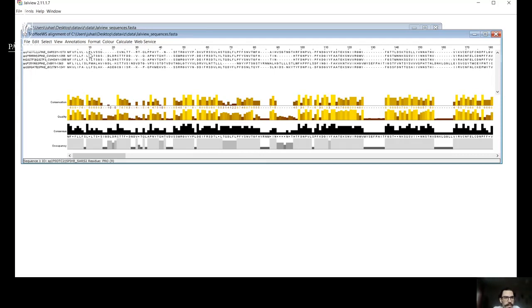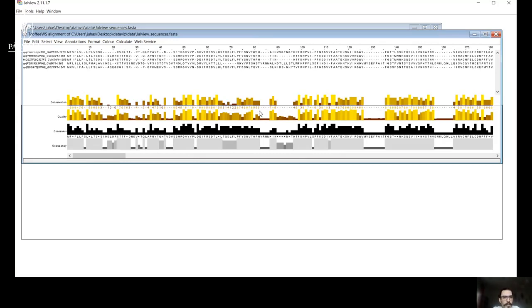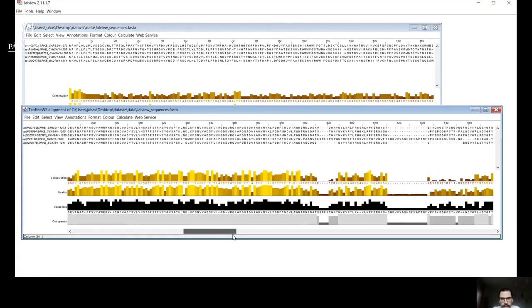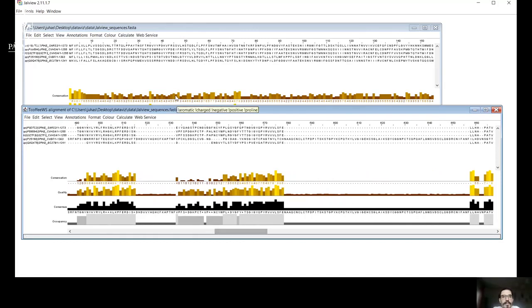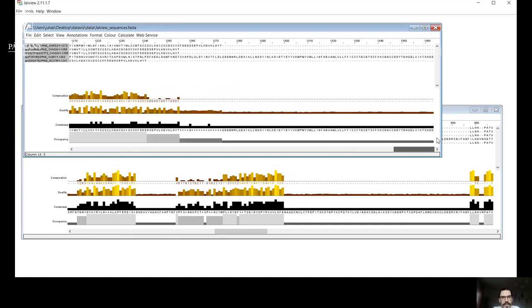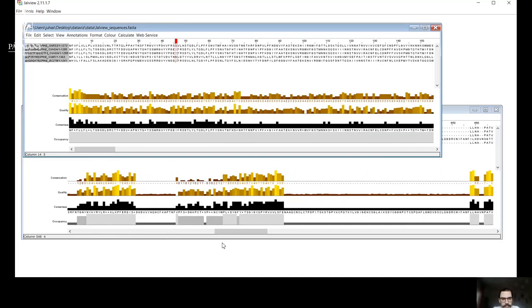We can see that there are gaps in each sequence. With these gaps, the sequences match better with each other. From the consensus plot, we see that we have many more highly conserved regions than we had in the case of the original sequences, when we just wrote them on top of each other.